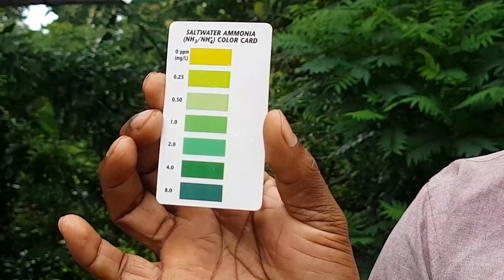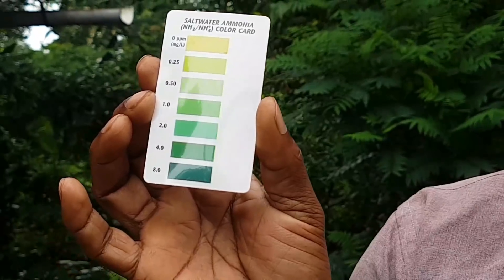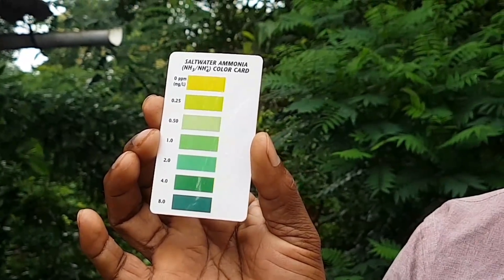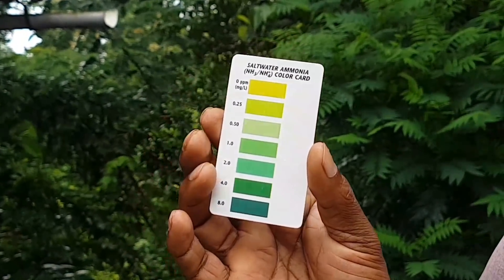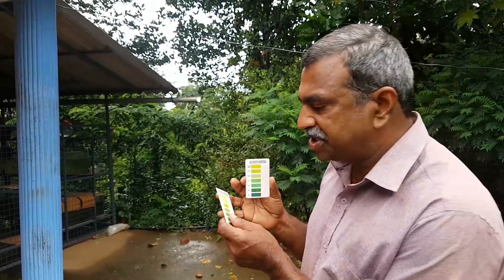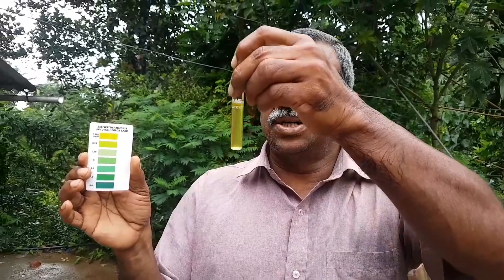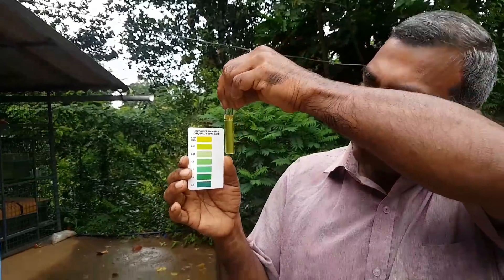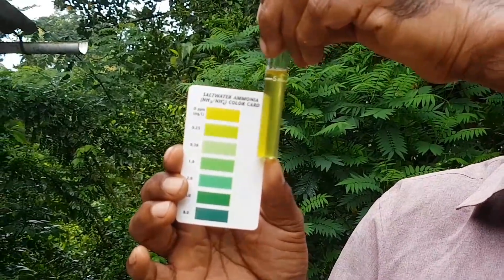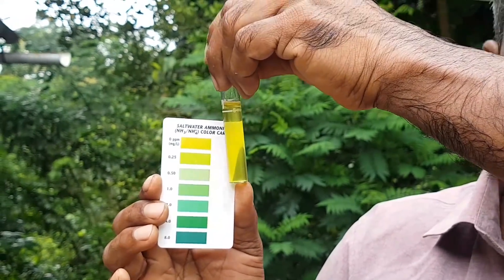This is zero ammonia — this is a good one for the pool. The pool will cover the pool. From the pool to the pool, the poll will be applied. Now, if you have any information, you can just add the poll. We put a new solution in the test tube. The test tube is zero ammonia.